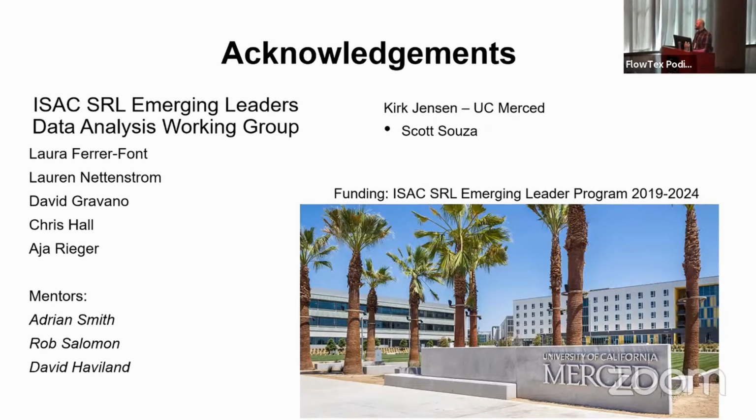There were some comments from people showing appreciation for your videos. They've seen them. Awesome. There's also one comment noticing that 30% are doing clustering, but only 10% are doing cleaning, so people are not cleaning their data before clustering. Well, I think people may be manually cleaning the data. There was a little discussion about this a couple days ago. Sometimes they may be a little aggressive, but we are doing some form of cleaning before.